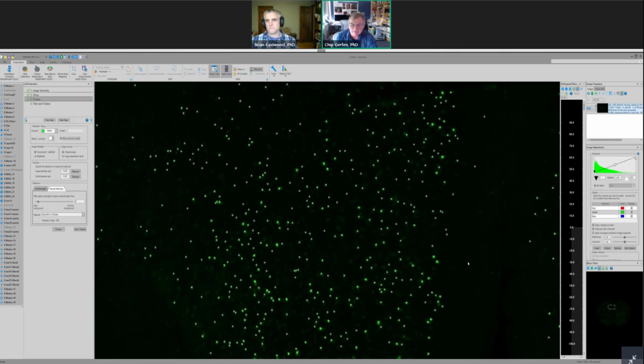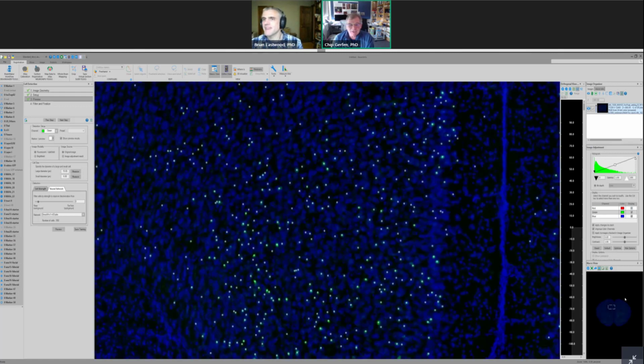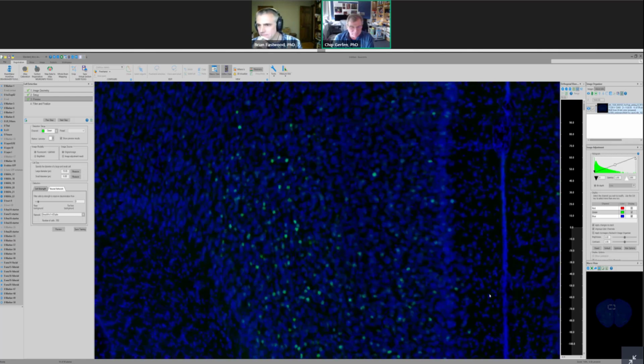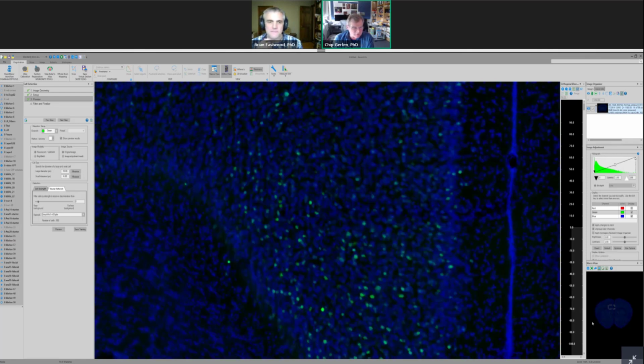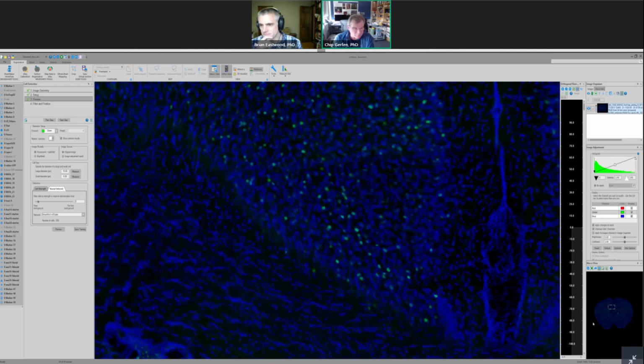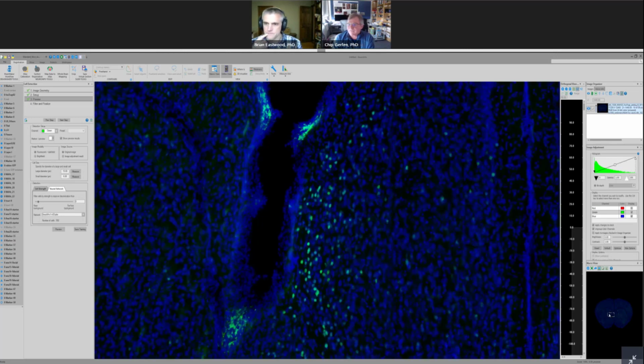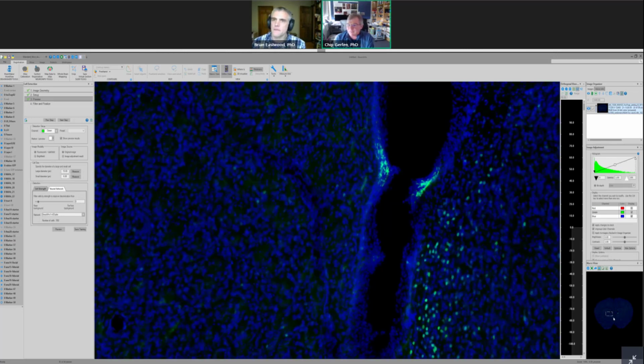There are a number of ways to deal with that. But we have created a neural network looking at these, and what Brian just mentioned is an important problem in terms of finding what cells we do the training on, in terms of what levels of intensity. So one of the things I want to show is that the LOG and that first neural network that I showed did a pretty good job of showing specific labeling.